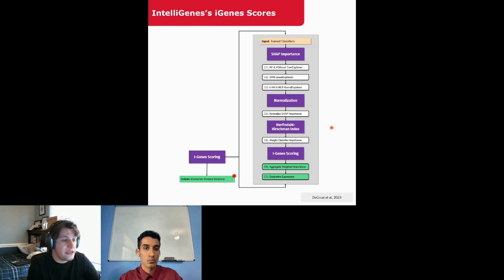IGene scores for each of the features in the feature set that you use to train a model will be scored from 0 to 1, with 1 being the most relevant. Each score is then ranked according to their relevance to a certain predictive condition. Essentially, the biomarkers with the highest IGene score were the most useful for making predictions across multiple classifiers. This usefulness usually indicates some sort of biological relevance, which we'll demonstrate when we go into the heart failure case study.